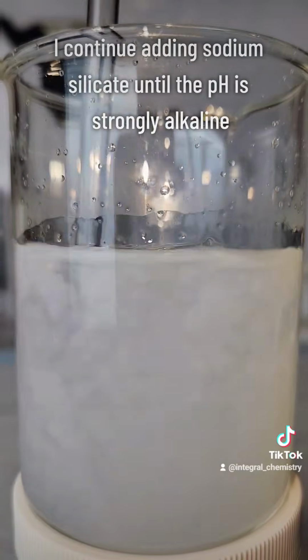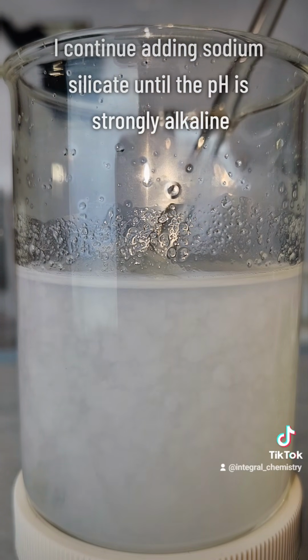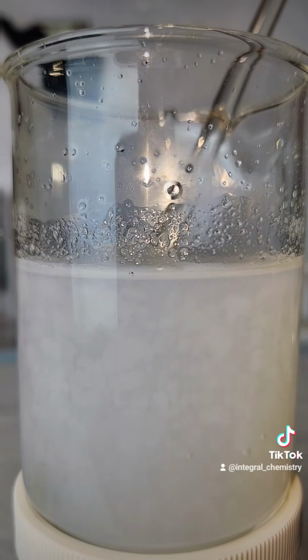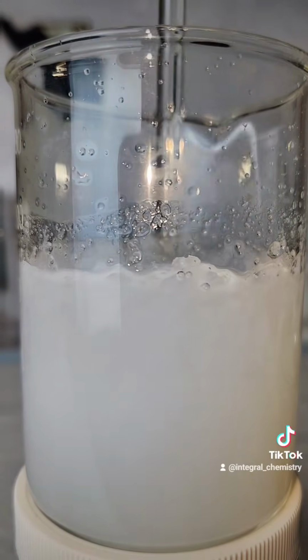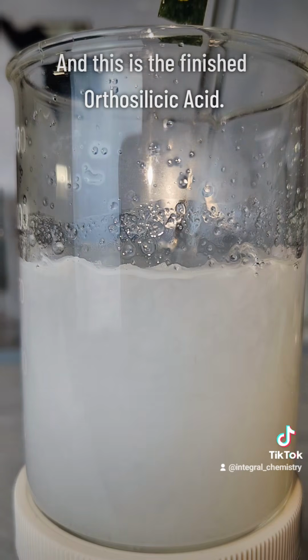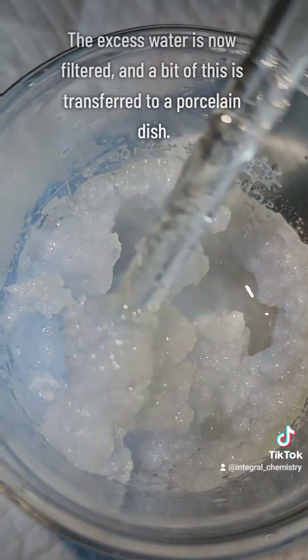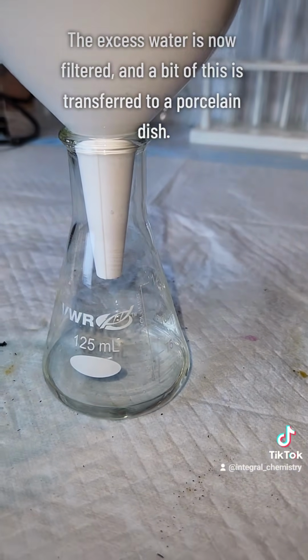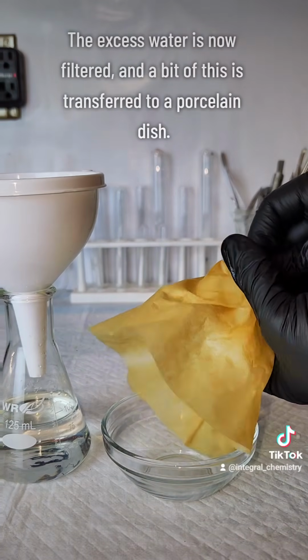To finish precipitating it, I'm going to continue adding sodium silicate until the pH is strongly alkaline. Remember that the sodium silicate is alkaline and bisulfate is acidic, so these two are also neutralizing each other. Once the solution is strongly alkaline and all the orthosilicic acid has precipitated out, the solution becomes extremely thick and difficult to work with. To that end, I add a little bit of extra water, break it up, and pass it through a coffee filter to isolate my orthosilicic acid.